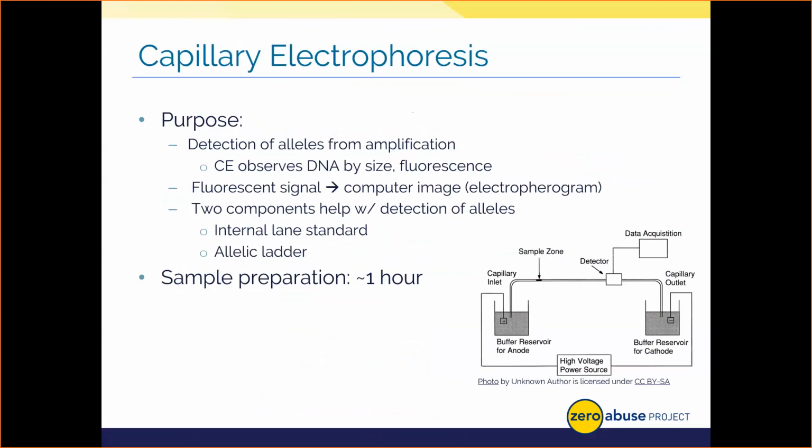This is kind of the final process in the lab as it involves DNA. It's used to generate our profile and see what pieces of DNA are present from the copied DNA we made in amplification. So what happens? Well, for starters, a laser excites the fluorescent tags on each piece of DNA, and a camera detects all the DNA as it moves through a series of small capillary or plastic tubes, and it gets detected.